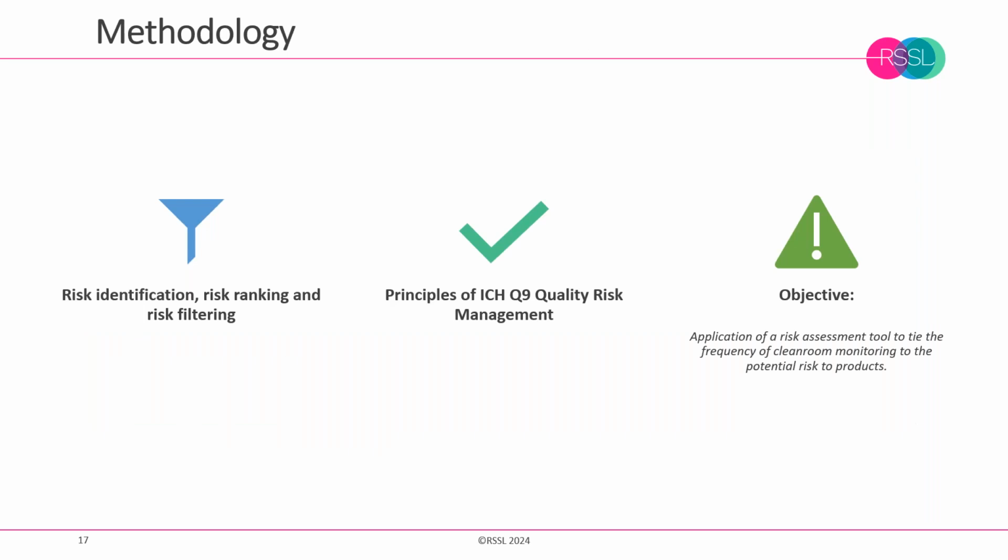So the aim of the exercise was the application of risk assessment to review the environmental monitoring frequencies based on identified risk factors in each given clean room in relation to the potential for microorganisms to exist, microorganisms to persist, and microorganisms to be transferred into product.